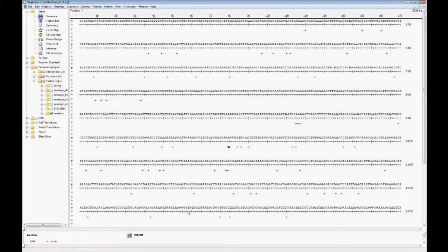Katie, is this a good time to forward you some questions? Sure, yes, go ahead. Okay, we have a few questions about the reference-guided assembly that you just showed us. The first question is, can I compare SNPs between samples?